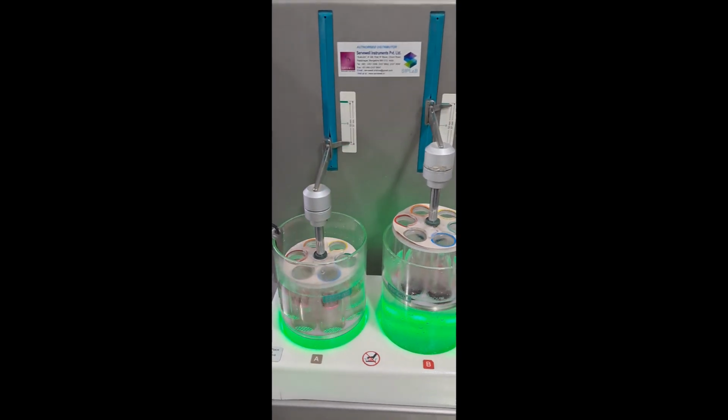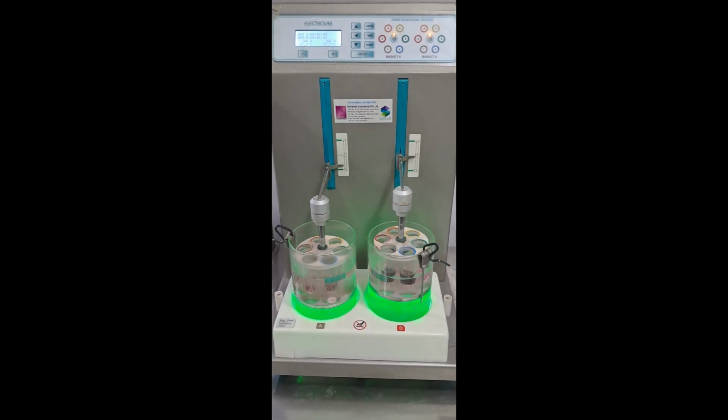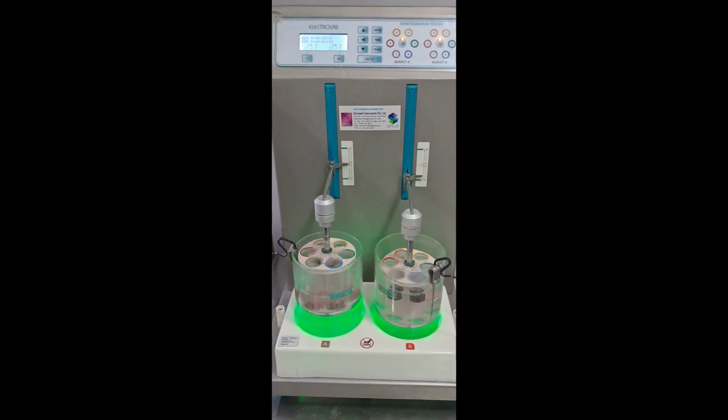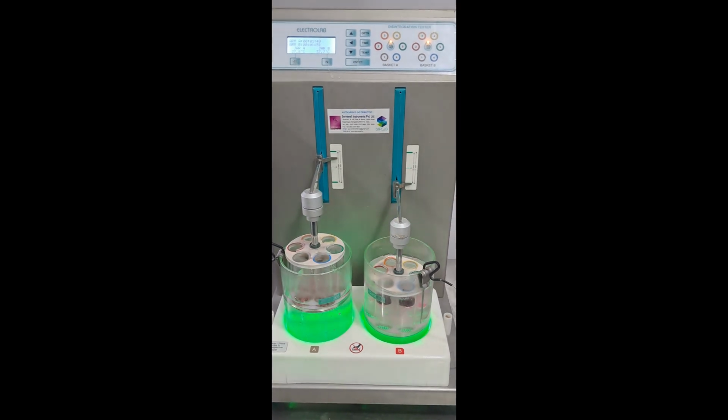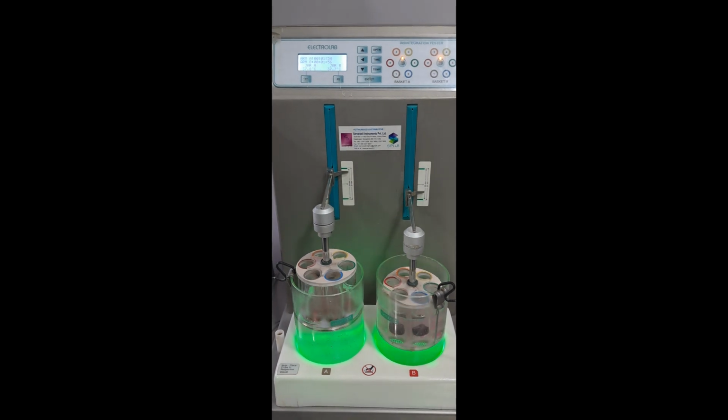9. Maintenance and cleaning. Rinse all wetted parts after each run to prevent salt crusting or biofilm. Schedule routine lubrication of moving parts and check for motor wear.